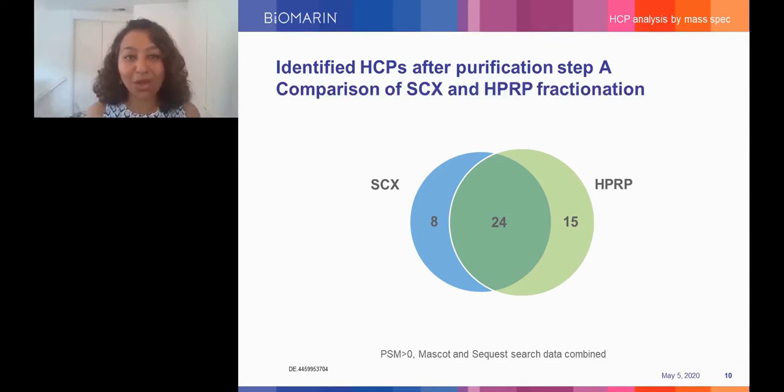It's not a whole lot more effort because you're just running that 1D chromatography separately and doing desalting. After that, you can combine all of the material and then run it, or you can run it separately, but you do get more IDs.